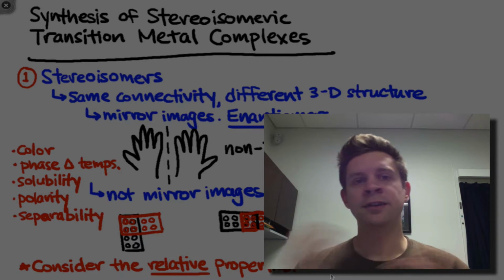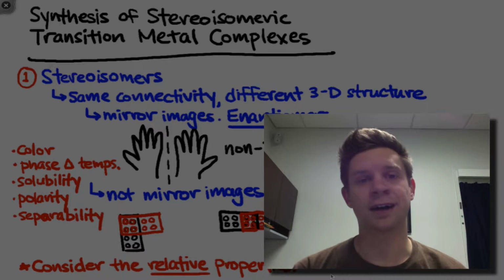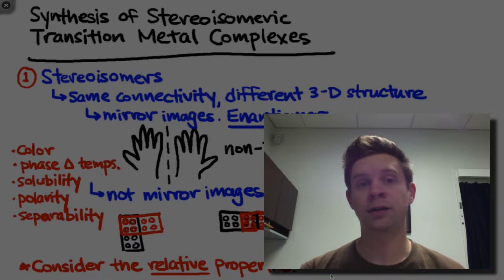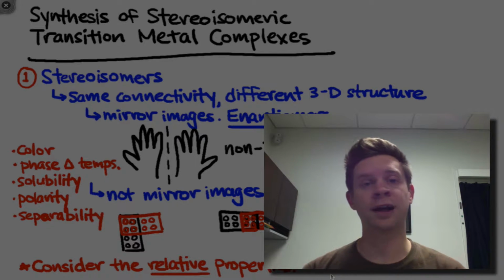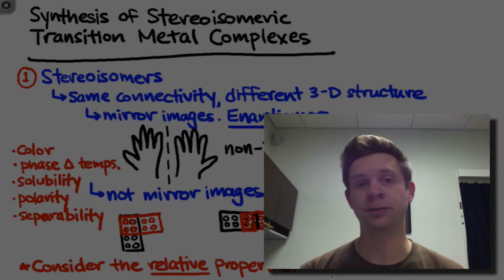And in addition to learning the techniques of inorganic synthesis and trying to achieve a high yield as usual, we're also going to explore differences in the properties of isomeric compounds. These ideas are generalizable, so when you get to organic chemistry, for example, you can apply the relative properties of a pair of enantiomers or a pair of diastereomers to organic compounds with these relationships as well.